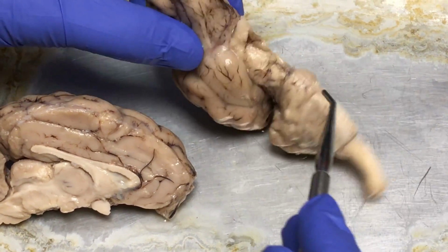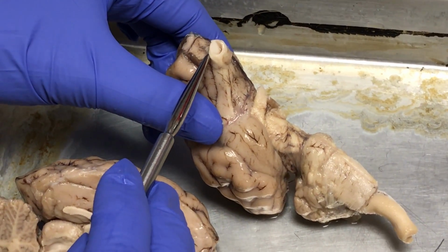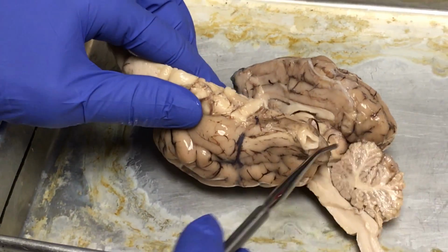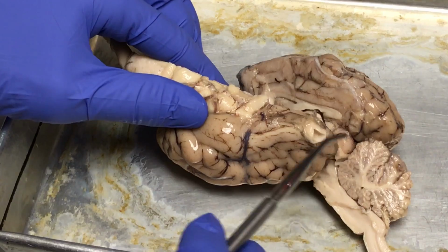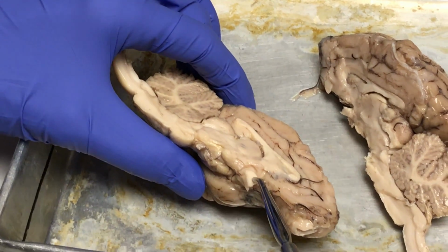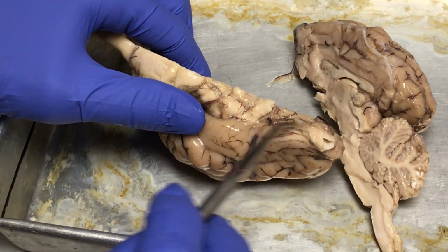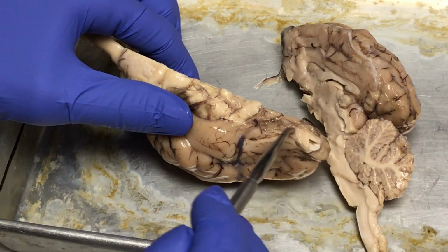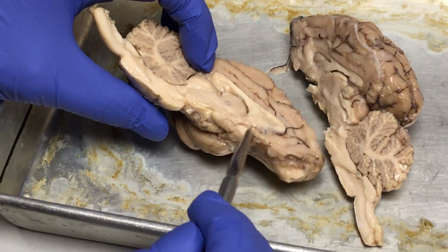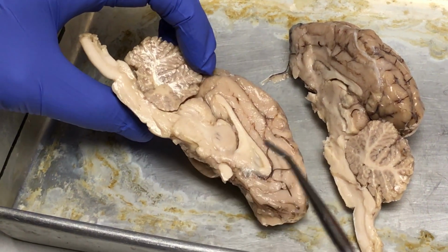And let's see, this would be the olfactory bulb. And is there anything else? Olfactory bulb, these are sometimes kind of torn. The optic chiasm. I'm sorry, the what? Olfactory tracts. Olfactory tract would be right here. I won't ask you to identify that. It's actually hard to see here on the sheep brain, but it would come back toward the brain from the olfactory bulb, and that's the optic chiasm there. And I think that's it.